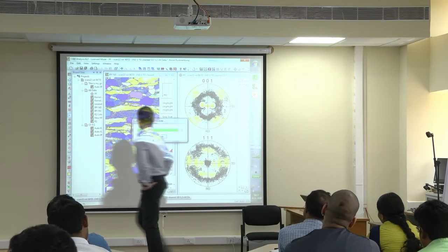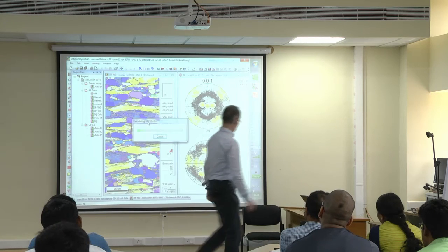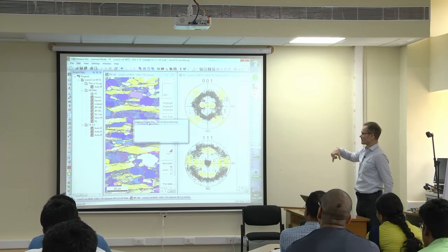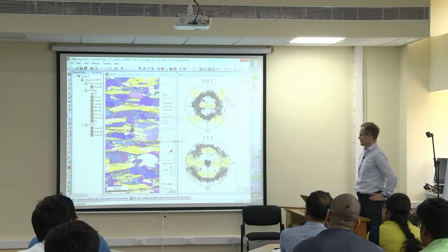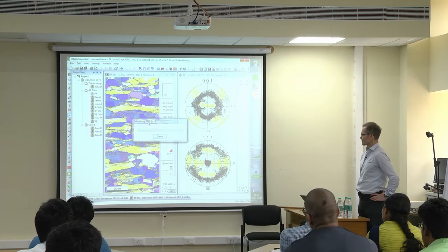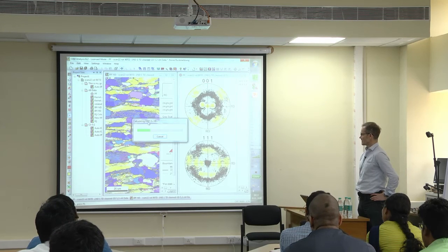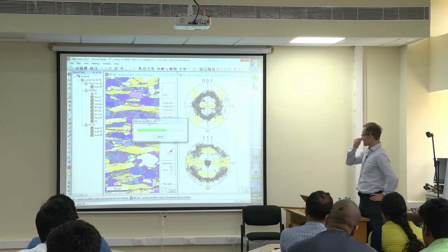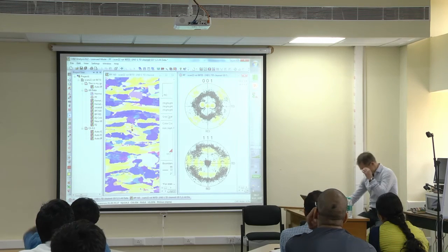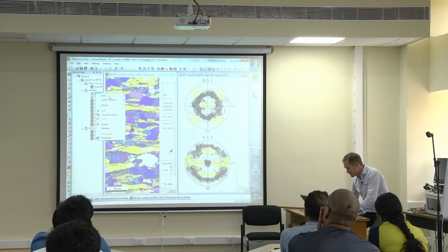Good, but we're coming to something. After 16, nothing will happen after these calculations. It has calculated all C coefficients. Now it just calculates the function. And here we go. And now it will calculate, I think, also the pole figures. But this is so quick that you don't see. And then you can go and say, okay, plot what you have done.